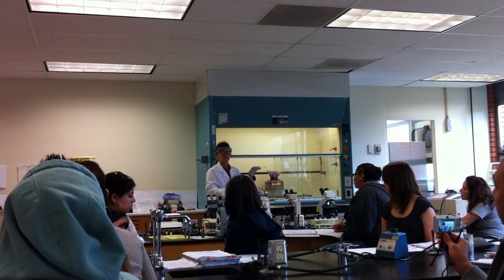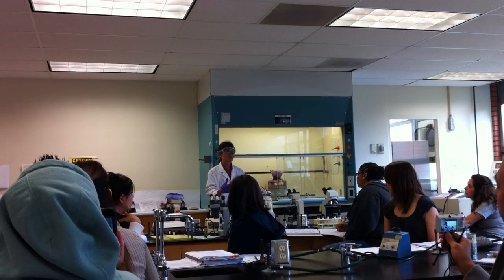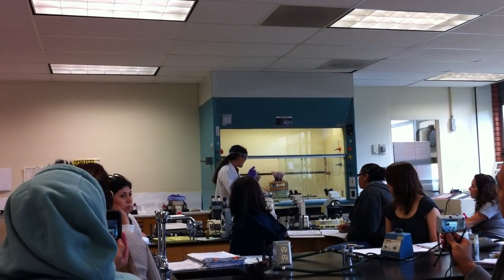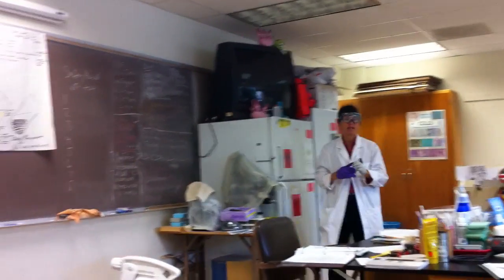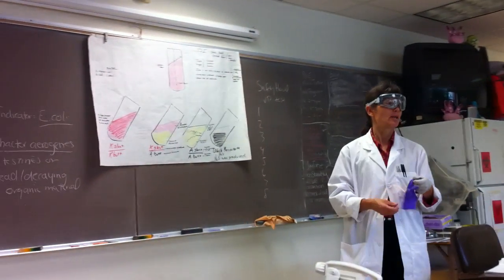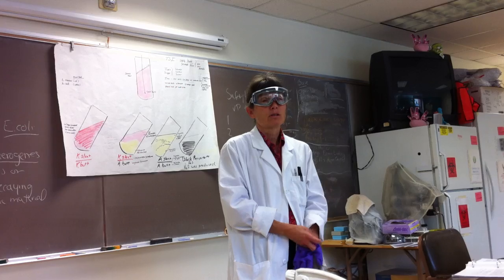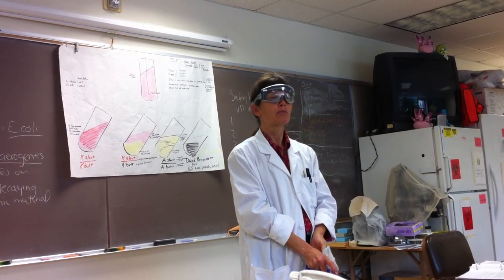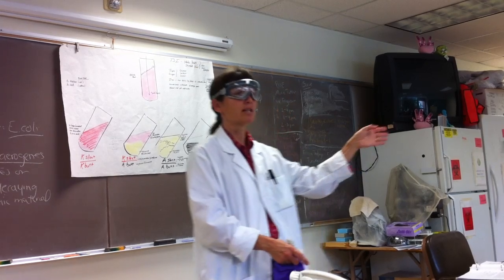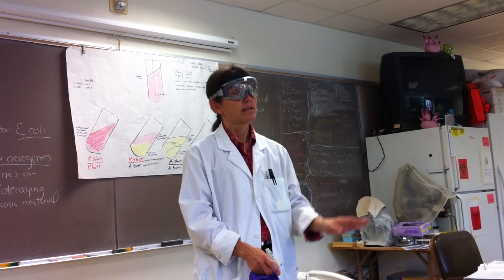And as always, you guys, we want to protect each other's backs. If we see our colleague is up here without gloves, without their goggles on, just remind them gently, we're trying to help one another. And just as a little reminder, we mentioned during the unknowns that you guys can't ask one another for help, but there is an exception. If you see your colleague doing something dangerous, or you see they've forgotten an important safety precaution, like you see them running the VP test without their goggles or gloves, don't hesitate to tell them.